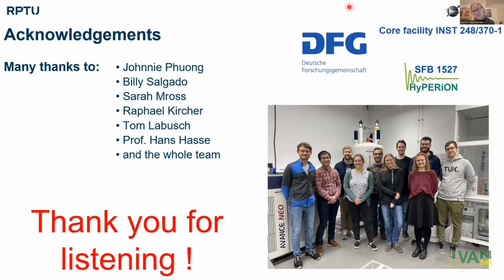And therefore you can saturate more than one of the hyperfine lines. So actually we are still a little bit power limited, let's say. I think if we would have more microwave power, also the enhancements would be much better. Thanks a lot.